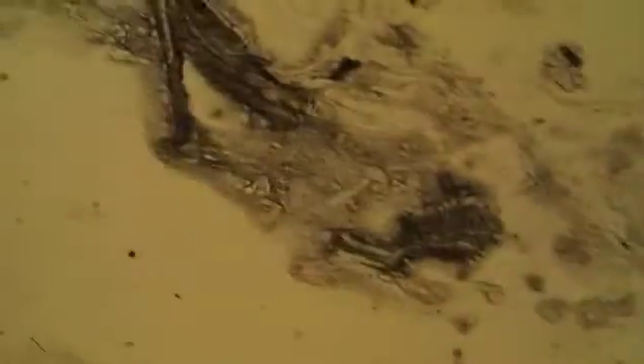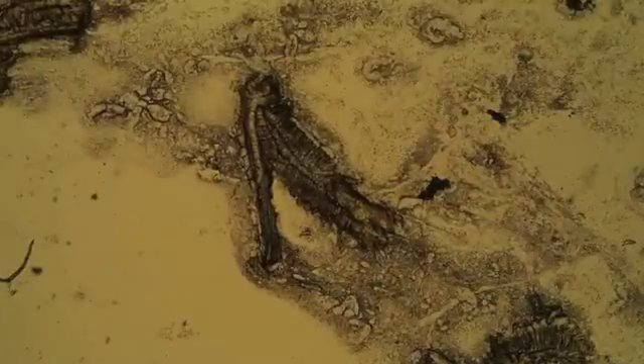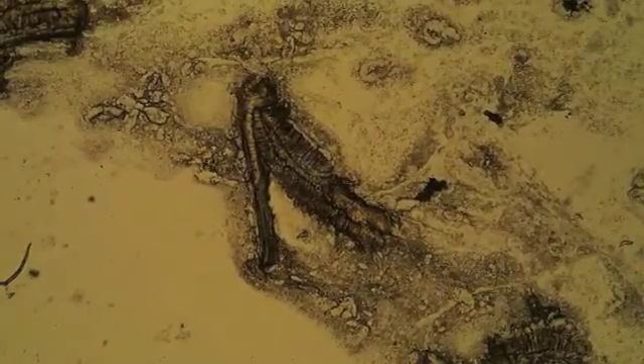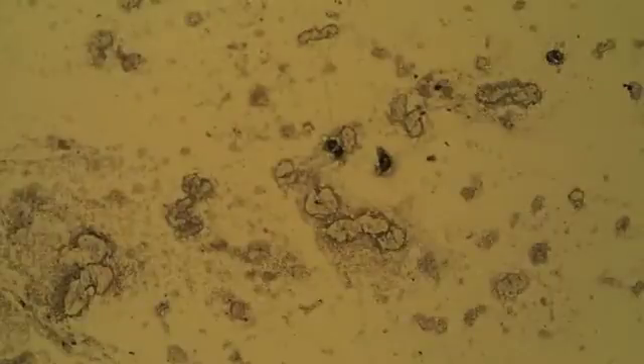The first thing we're going to look at is the gill flukes. Here we've put the slide of the gill biopsy of a specimen that had a gill fluke infestation under the microscope. What you can see here are some gill filaments — primary filaments with secondary lamellae sticking out to the sides — and intermittently you can see some dark regions. Let's zoom in on those darker regions and have a closer look.